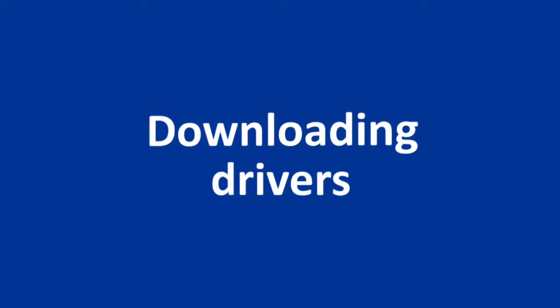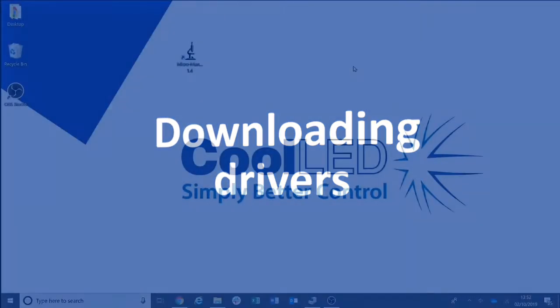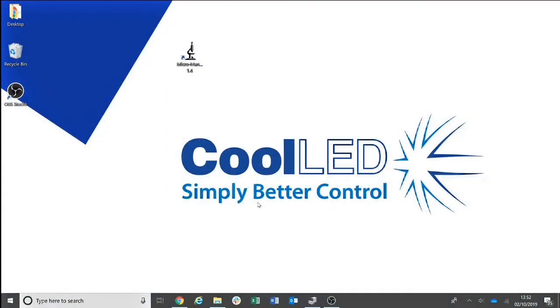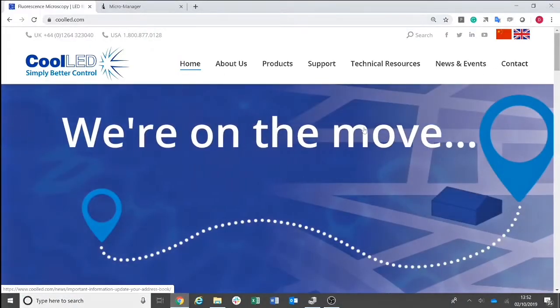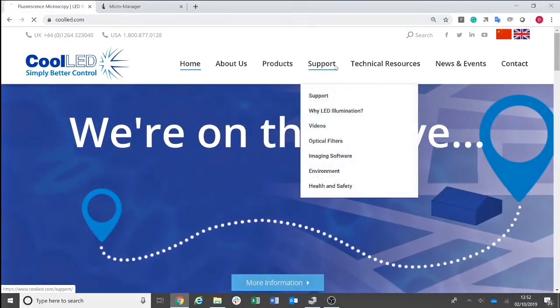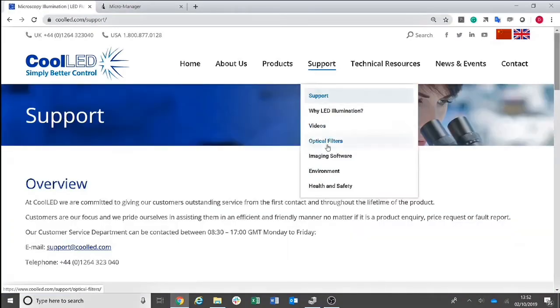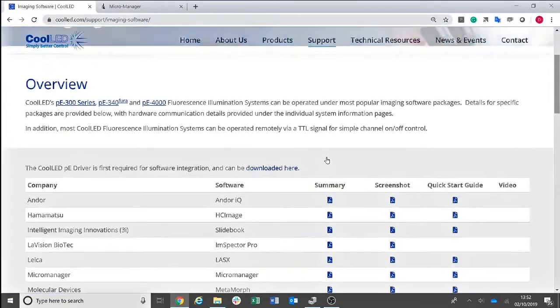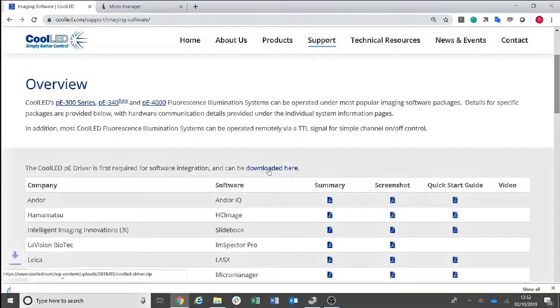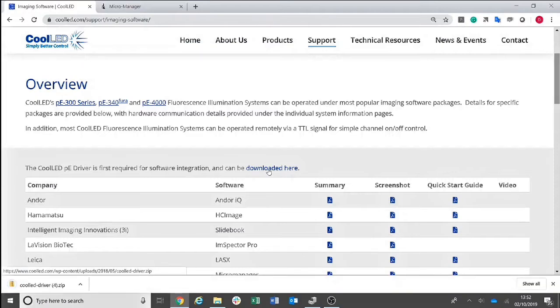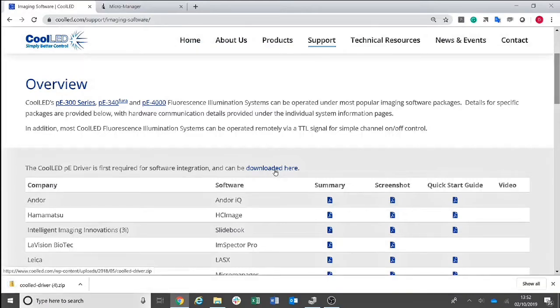First of all, you need to ensure that you have the CoolLED drivers downloaded from the CoolLED website. This can be found under Support, Imaging Software and then downloaded here. Ensure that they are saved somewhere memorable, such as your desktop.